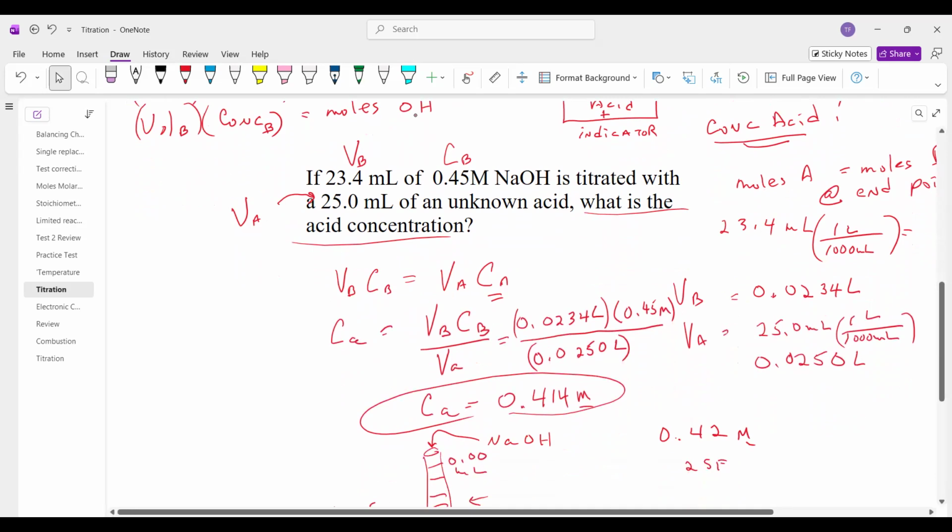Okay, so it's all based on acid and bases neutralizing one another. Now, in the stock room, we've got probably 25 indicators. And the one we use 99% of the time is phenolphthalein, the Barbie pink indicator. It's extremely common.